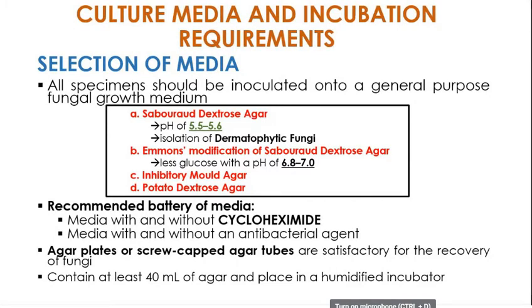Now, another one is, nabasa ko sa isang book ng microbiology, di ba sabi natin, to avoid the dehydration of the media. So, the more the media, the less ang dehydration. So, yung dehydration niya is hindi kaagad mangyayari. Okay? So, the moisture is kept. Now, you have a bigger volume of the agar.